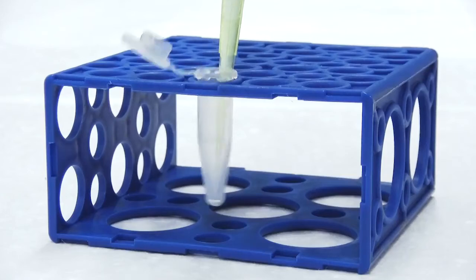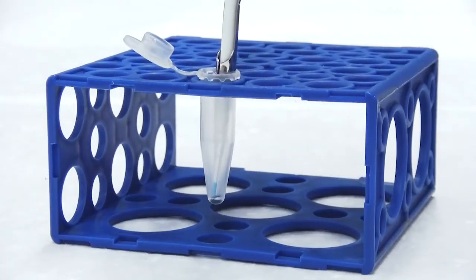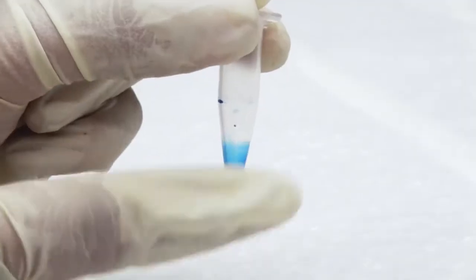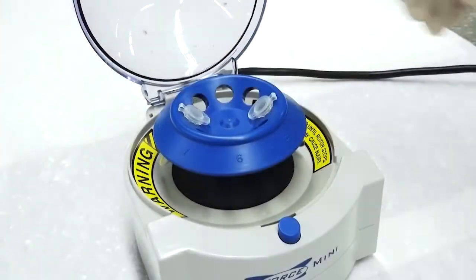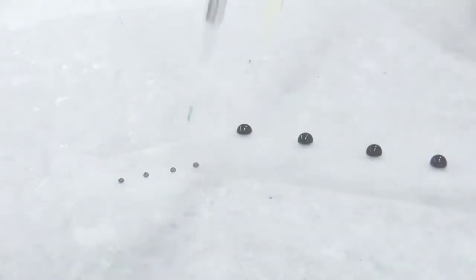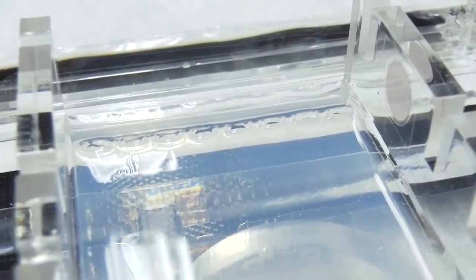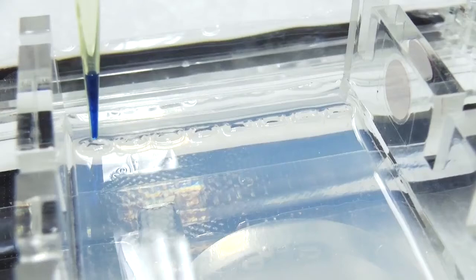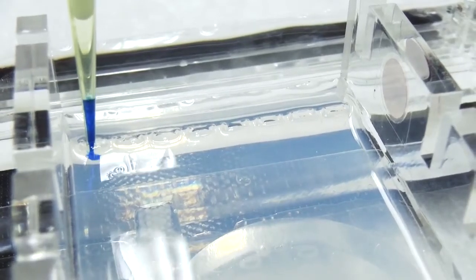Mix loading buffer into the nucleic acid sample tube and centrifuge before loading, or mix loading buffer with the nucleic acid sample on parafilm before loading. Load the samples into the wells. Be careful not to poke the gel.